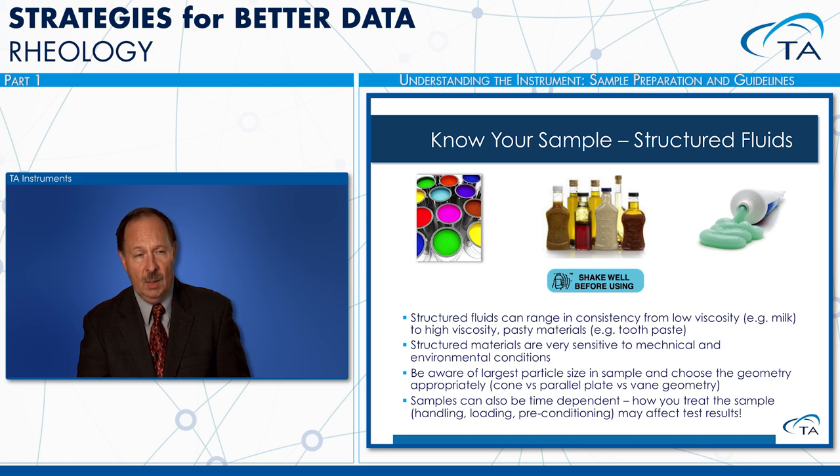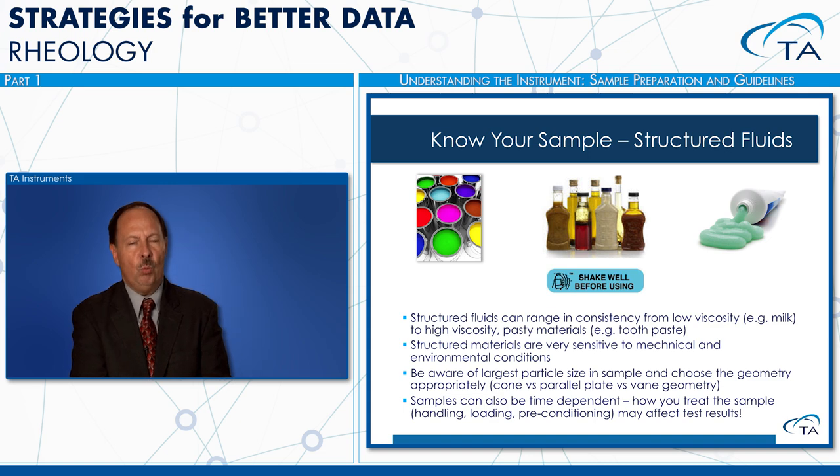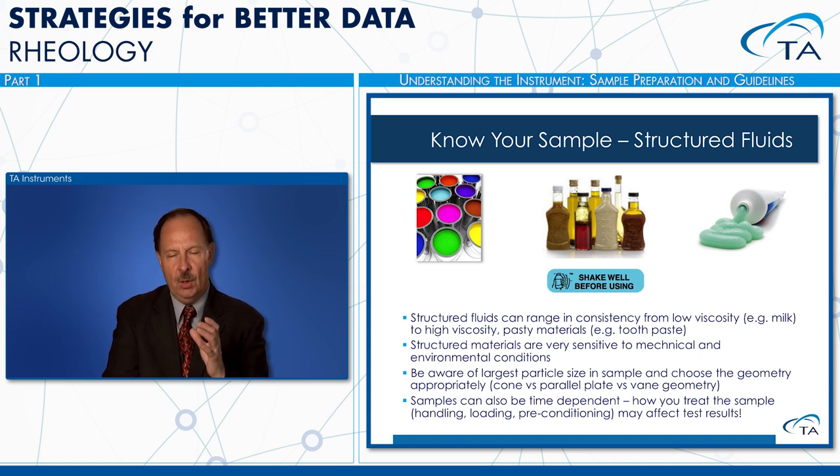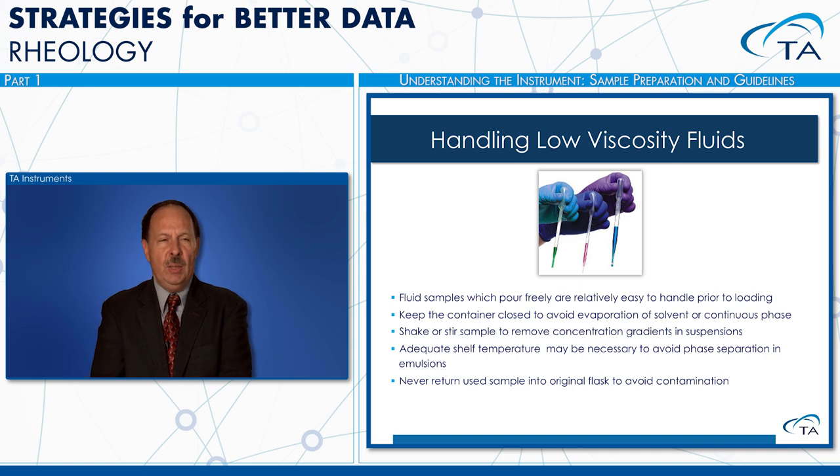And a lot of these properties can be very time dependent, and the way you load your sample onto the material can affect the final results that you get. And at times, there's a lot of effort that goes into writing up your procedure so that you are confident that you're going to get good, meaningful, and reproducible data. So we have some tips over here, and there will be more tips given in some of the other segments that are part of this presentation.